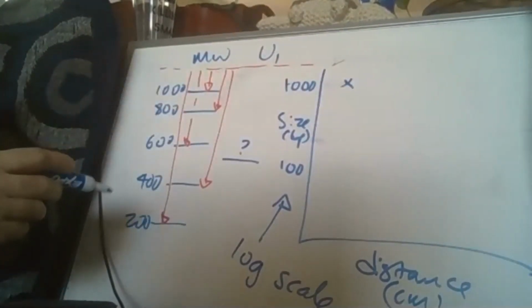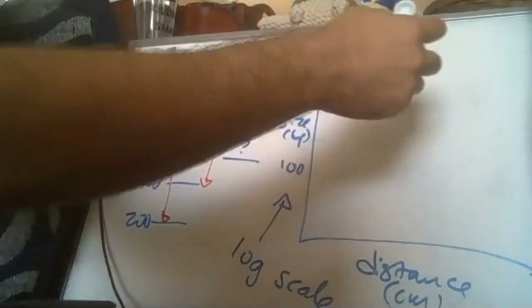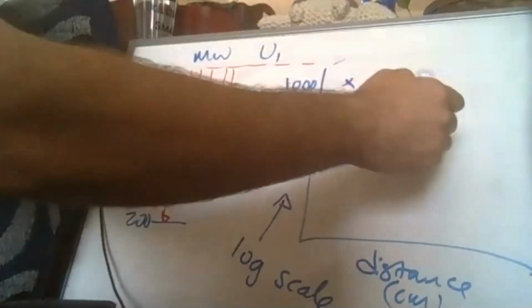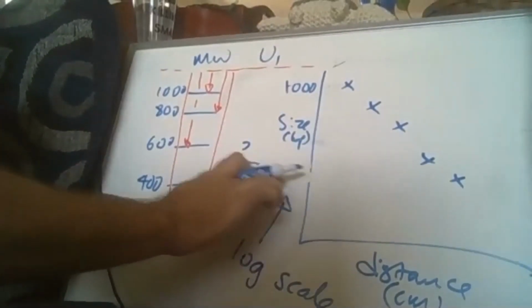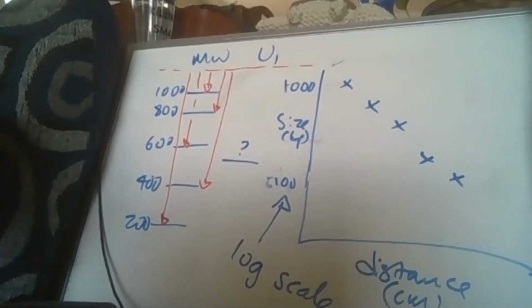It's obviously an inverse relationship because small stuff travels further, right? So the bigger the thing, the smaller the distance. But you'll get something that looks like, how many we got? 5. Something like that. Give or take. Does that make sense, Rose?